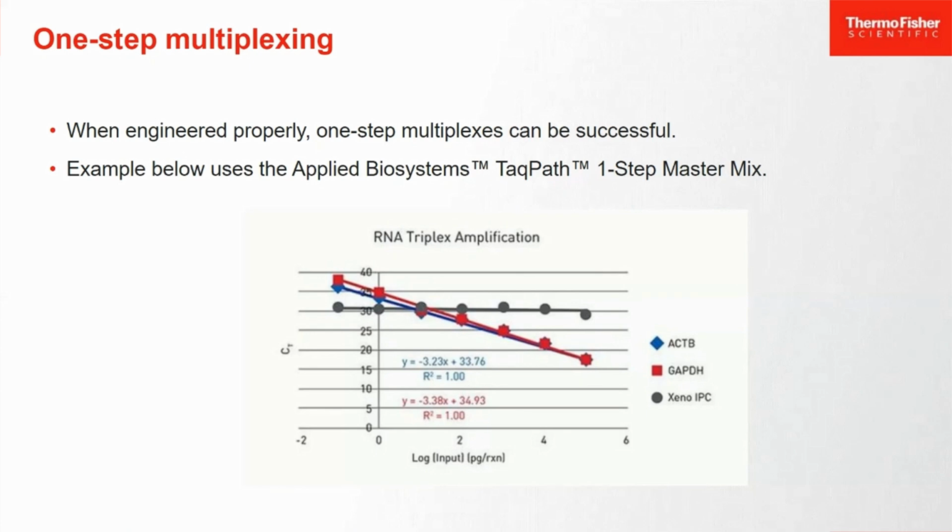But that's not to say you can't multiplex with a one-step. You certainly can. They can be successful. This is an example shown here of a triplex using the TaqPath one-step master mix.